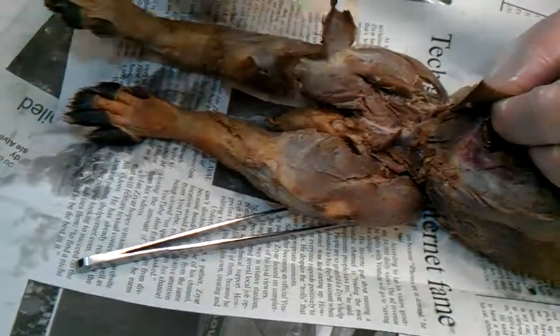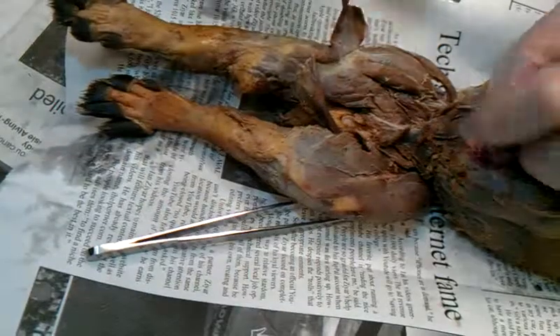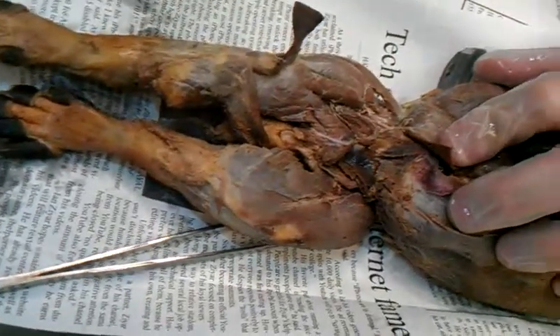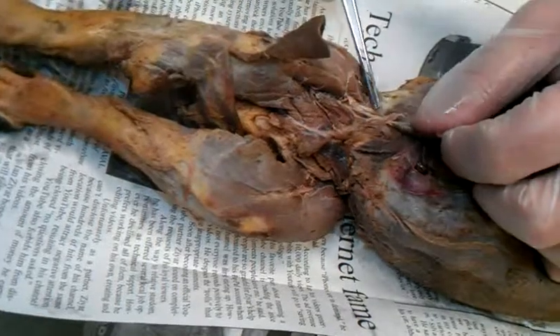Oh, nice pectineus — somebody did a good job. You guys got the pectineus, very visible. If we clean it up and really push the abdominal muscles back out of the way, you can see this muscle that goes right through the abdominal wall.